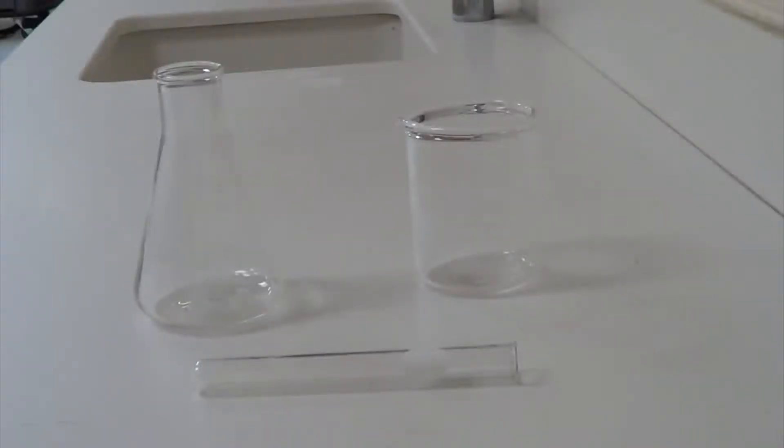Hello everyone. Today we're going to be looking at glassware safety. Before we do this, we should probably know what types of glassware we're going to be dealing with.